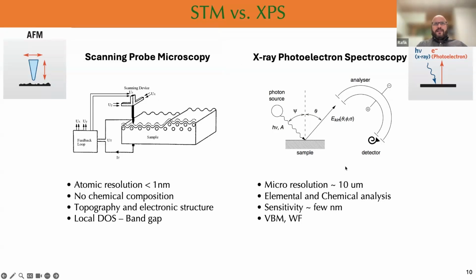On the spectroscopy side, the technique that I have is XPS, which provides chemical composition information, including chemical bonding and concentration. It is a useful technique to analyze surface contamination and identify elements, their concentration, and their chemical bonds.